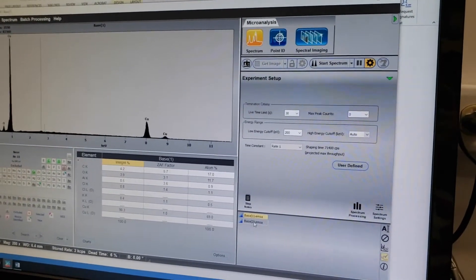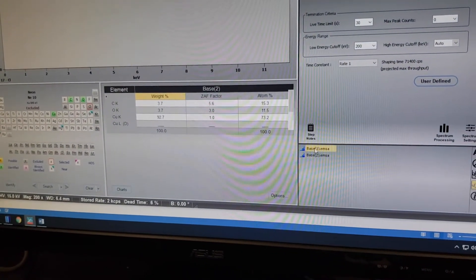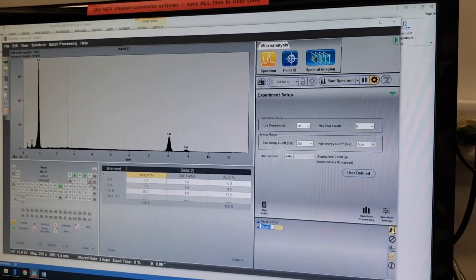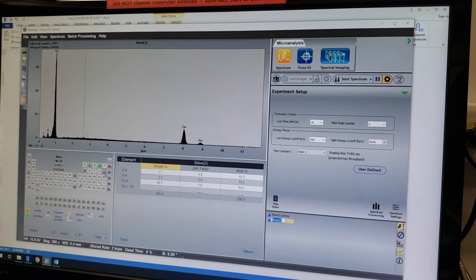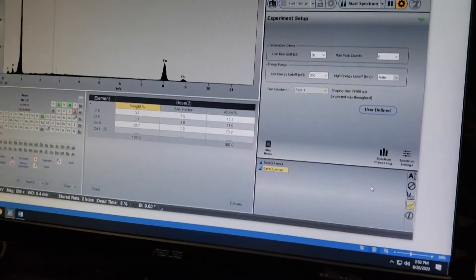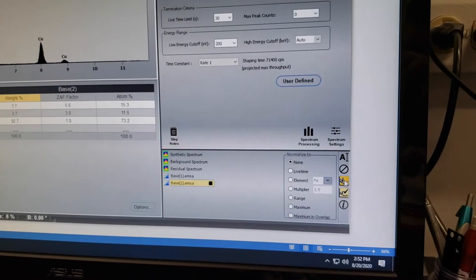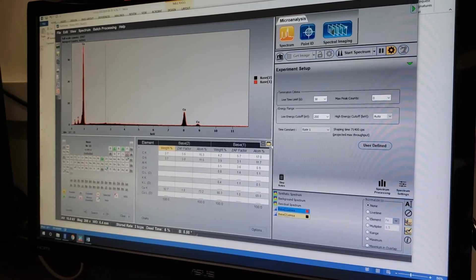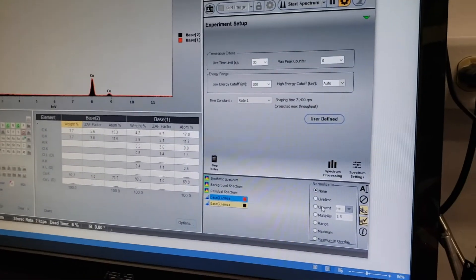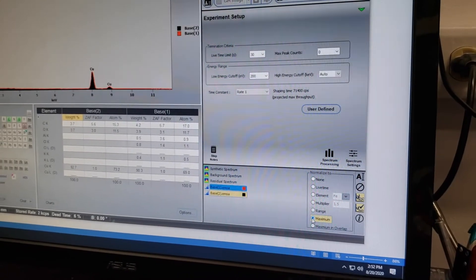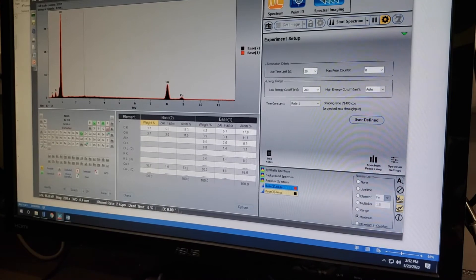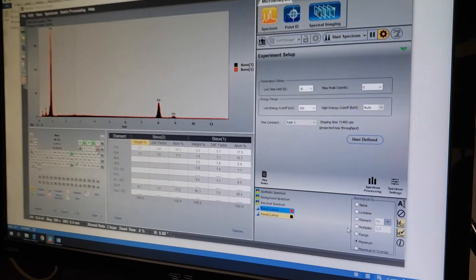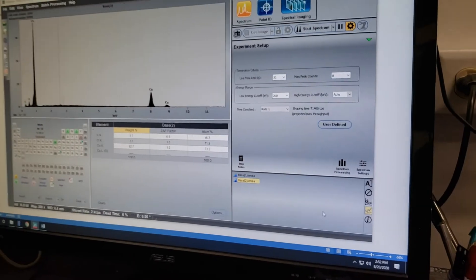You can see down in the bottom corner we now have two spectra: Base 1 and Base 2. You can rename them by clicking the little A button. You can also overlay them by clicking the overlay button to select multiple, then normalize them to their maximum — that makes the copper peak look the same on both so you can compare the other peaks. That is the end of Spectrum.